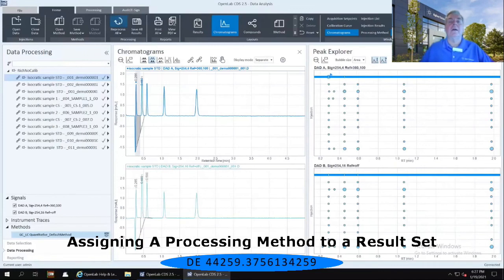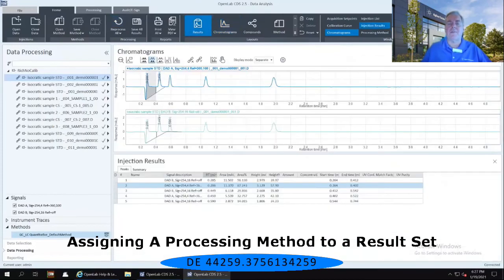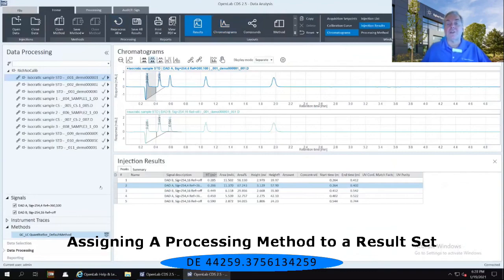And currently we still have the chromatographic layout open. In this case, I want to go back to the result layout instead of the chromatographic layout. That's going to give me my chromatogram window up top and then my injection results down below.